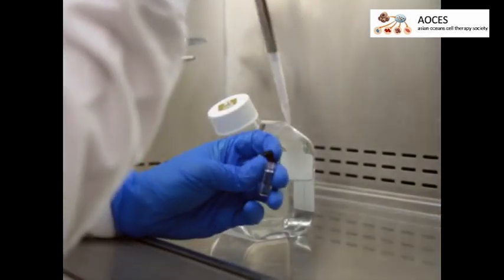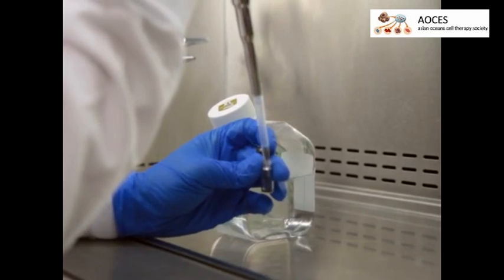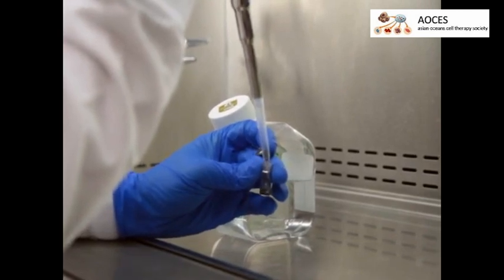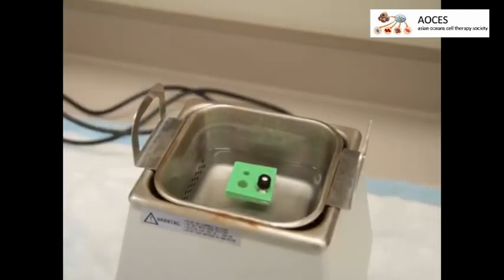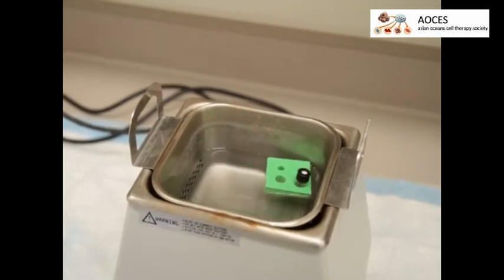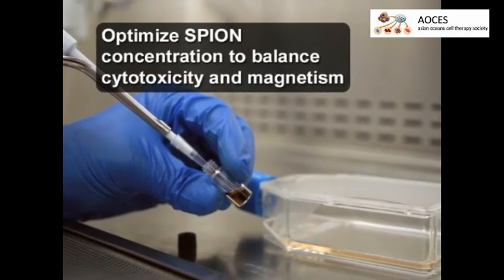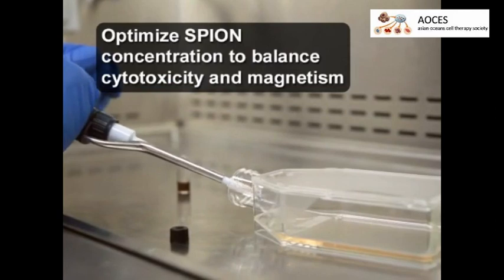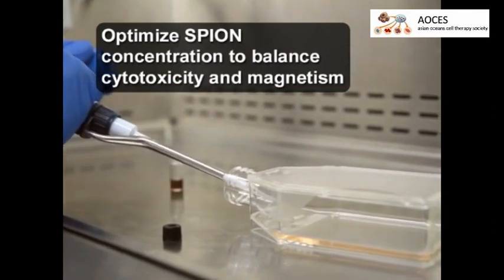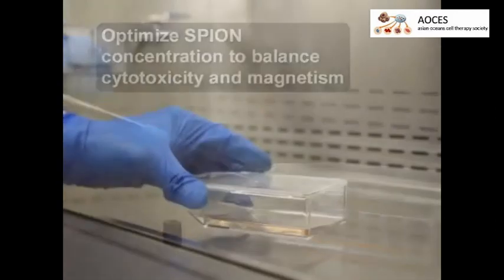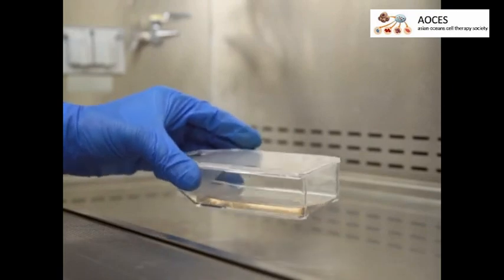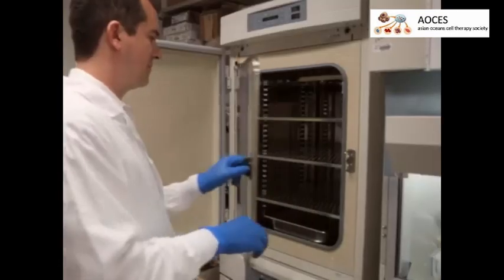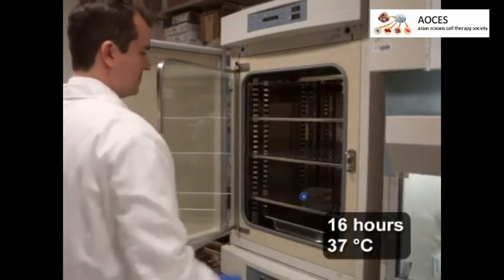To prepare for cell labeling, first suspend spions in PBS at a concentration of 40 milligrams per milliliter and sonicate them for 30 minutes. Next, add the solution to a flask of nearly confluent cells at a concentration of 5 microliters per milliliter of cell culture medium. Rock the flask to evenly distribute the spions. Incubate the cells for 16 hours at 37 degrees Celsius.